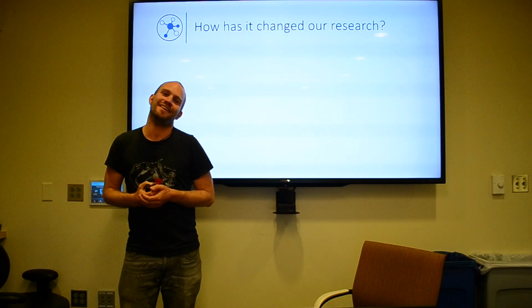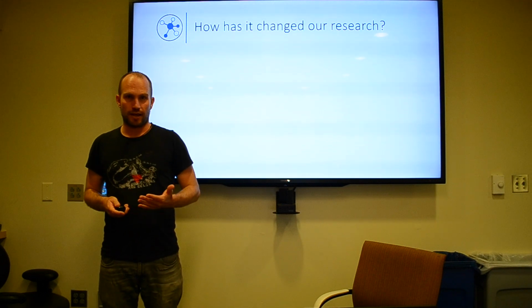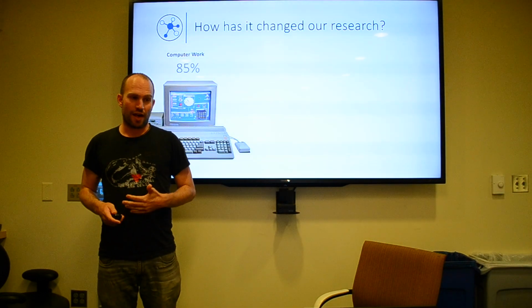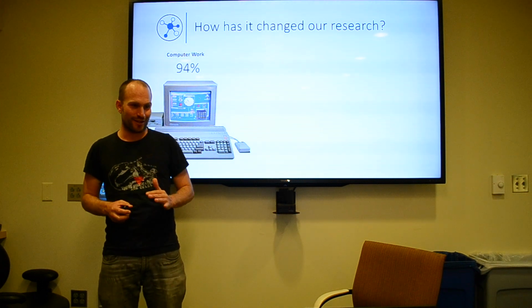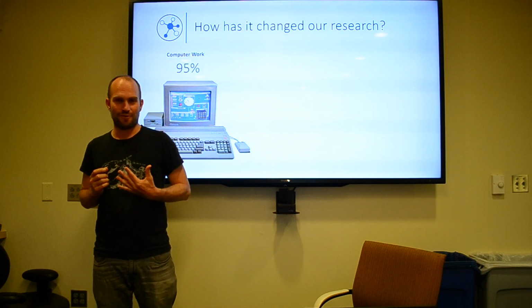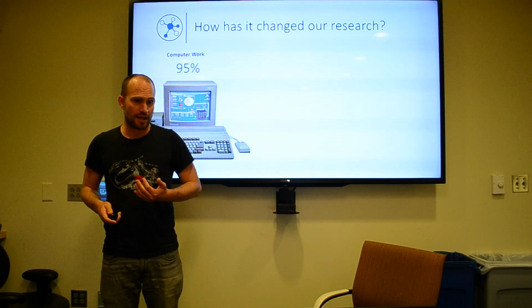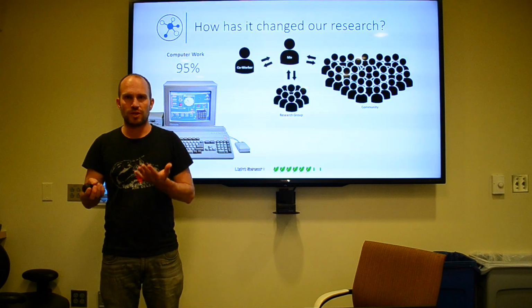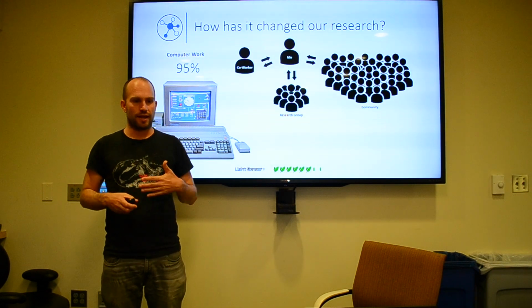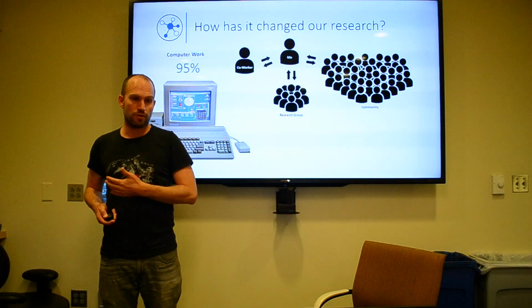Yeah, thanks a lot, Ming. So how has this changed my research so far? Looking at our days, the computer work is definitely not going to become less and will probably even shift more towards that side. Working with the dashboard so far definitely made that interaction so much easier. It saved me so much time inspecting data from both collaborators and during peer review.